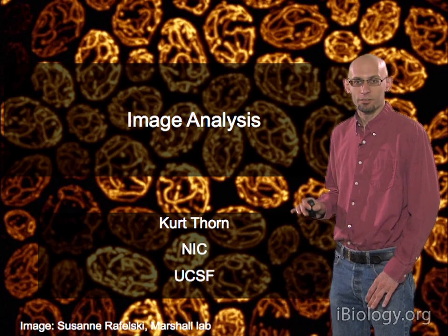And so the way this works is here we've got a little 3x3 square here. And the idea is if we wanted to apply this to a single pixel in the image, we'd center this 3x3 box on that pixel in the image, and then go around and take the pixels around it and multiply them by these numbers, add them all together, and then replace the central pixel with that value. And so what this particular kernel does is it does a smoothing or an averaging filter. And so it takes this 3x3 neighborhood and replaces each pixel with the average of its neighboring pixels.